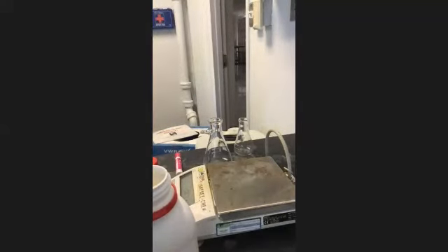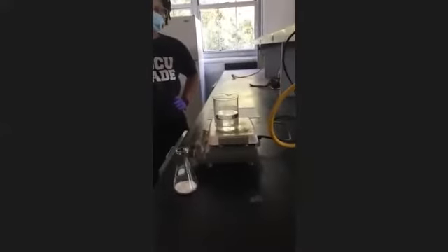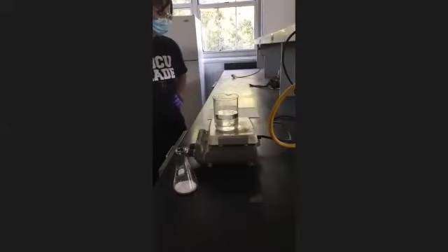All right. So the next step is gonna be hot plate. It's hot though. The next step is gonna be to add, so we got 2 more steps. We're gonna add acetic anhydride directly to that Erlenmeyer flask. And then after we do that, we're gonna add some sulfuric acid as a catalyst. It says 6 to 8 drops.